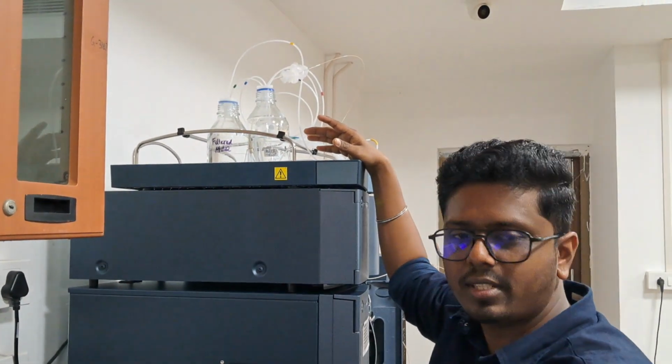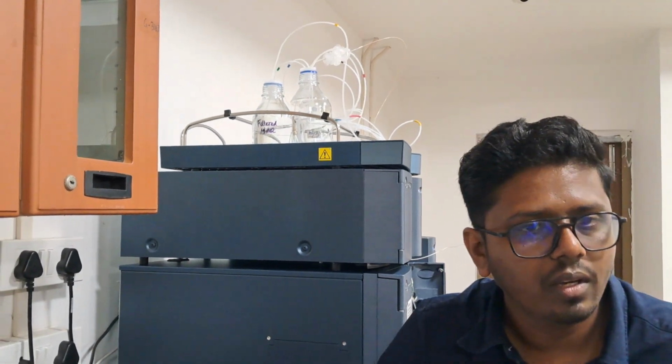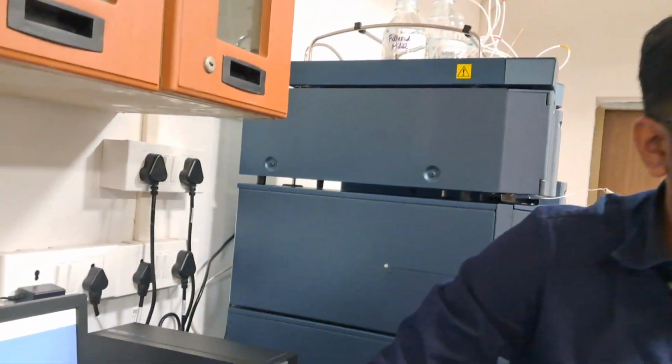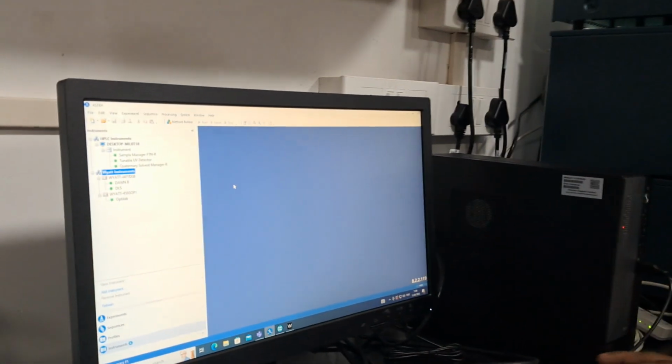Whenever the mobile phase gets changed, it is better to prime it first. So today you are running the sample again? The BSA, just for clarity. Yes, today we'll repeat it, from the start.